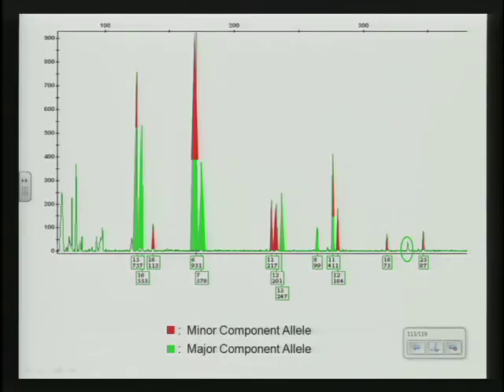So you look at the next series, you've got D3. Here at D3, the major component is actually looking like a major component. The next one looks horrible at this. I'm not good at memorization. Though it starts looking a little bit closer to 1-to-1. Look at D13. It's looking a little bit more, maybe 2-to-1-ish, with the minor component starting to take over. But you get down here, and you've got these 2 alleles that are showing up. What's actually showing up at the bottom end of this, or the higher molecular weight, is actually the minor component. The alleged major component is completely dropped out at this point.